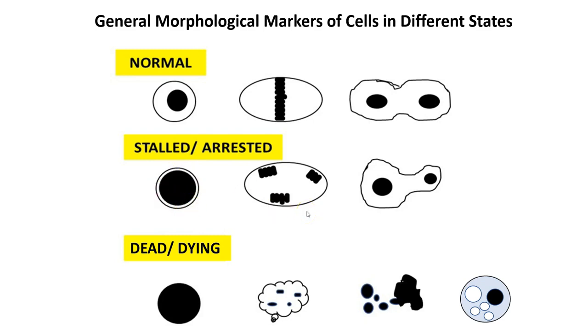You can also have cells that were maybe not so damaged that they got stalled in the middle of cell synthesis or the end of the synthesis phase, but rather went a little further and attempted cell division. Sometimes they were damaged in a way that they are no longer able to form a nice clean metaphase plate, because the DNA is damaged or not equal, the chromatin is mismatched, so the chromosomes can't quite line up the same way.